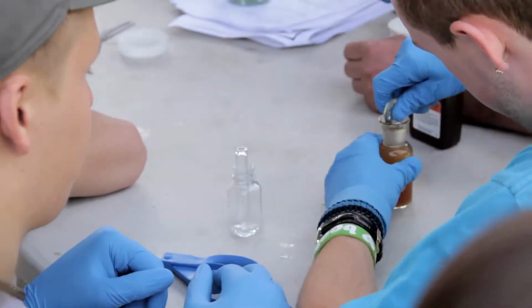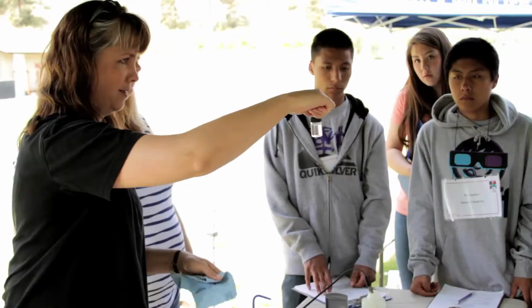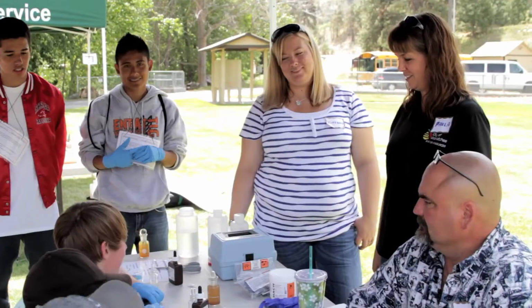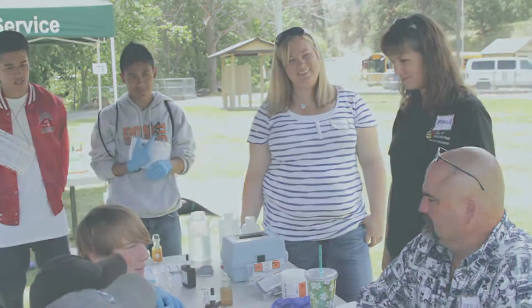Each test uses a different piece of equipment. Each is independent, but each is also connected. Try to get students to understand how and why this is the case. In conclusion, summarize the lessons learned in the Water Quality Station.